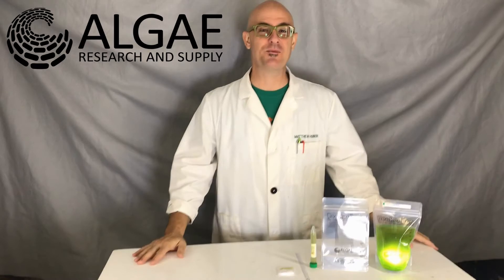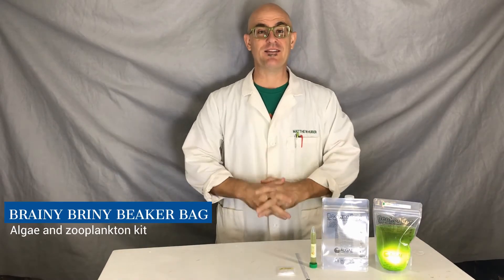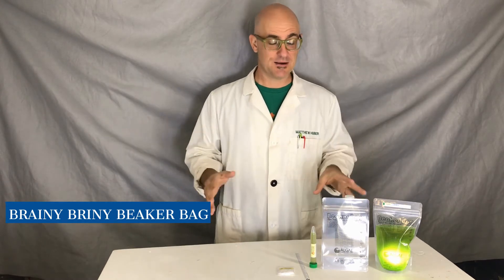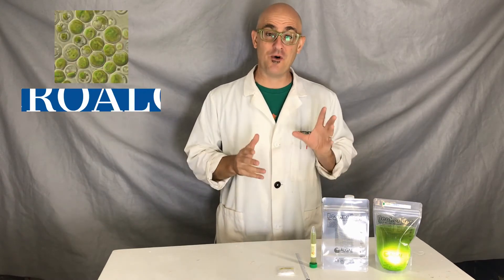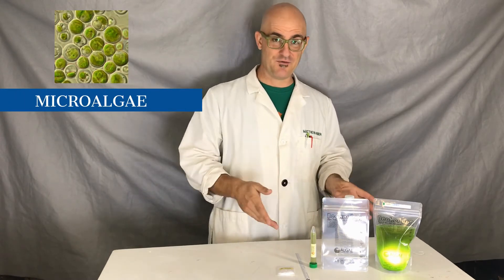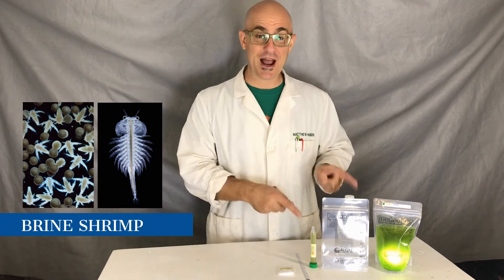Hi everybody! This is Matt Huber with Algae Research and Supply, and today we're going to talk about the Brainy Briny Beaker Bag. This is a very simple way to grow microalgae, measure or quantify the growth of the algae, and then convert that algae biomass into brine shrimp biomass.